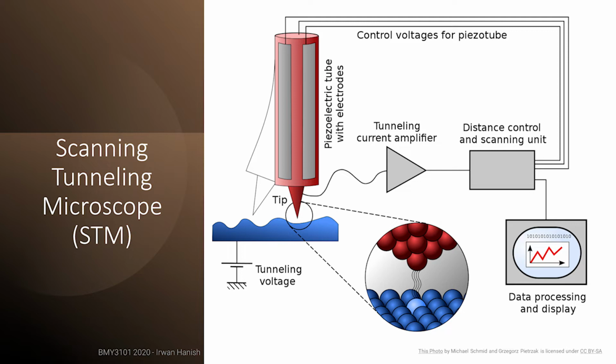you see, electron clouds, if you remember when you learned chemistry, are not like clouds of solid electron balls floating around. Electron clouds are more like waves of probability, wave function. So the wave of your probe and the wave of the specimen can overlap.